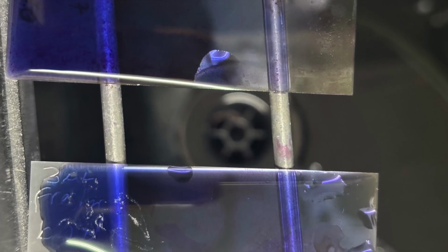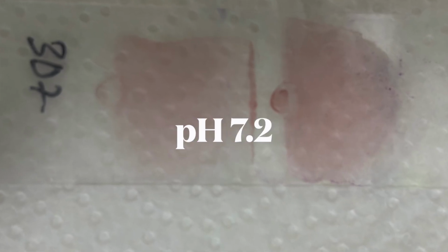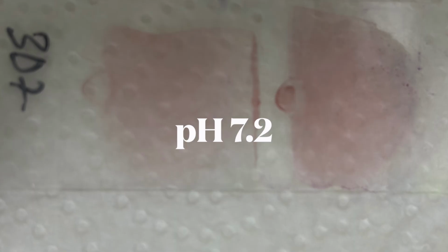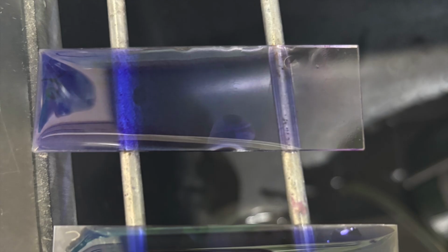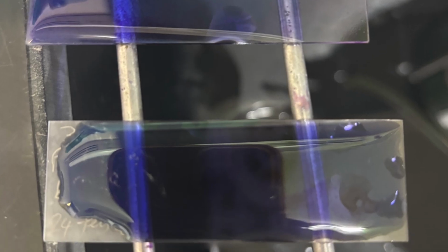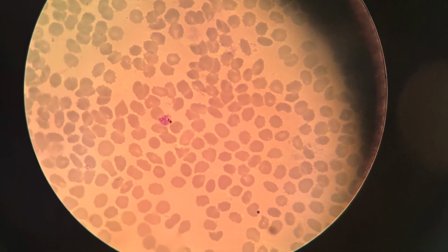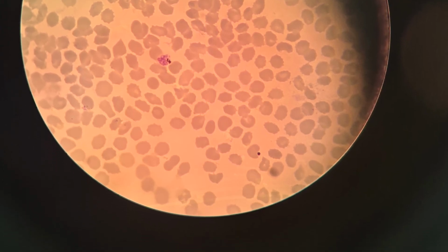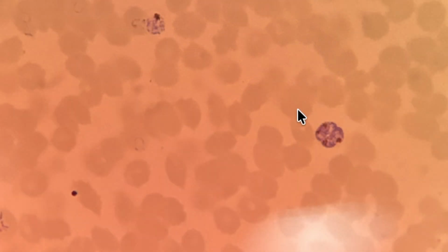Giemsa staining is pH sensitive, and the optimal staining occurs at pH 7.2 buffered. So if the pH drifts and becomes too acidic, you get excessive eosin binding. An overly pink smear is the result. If it's too alkaline, you get excessive azure binding, and this is an overly blue smear. This directly affects contrast between parasite and red blood cells and chromatin visibility.